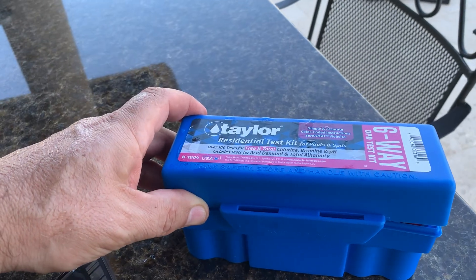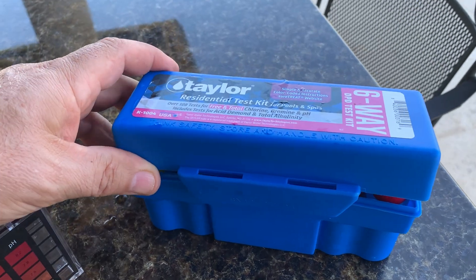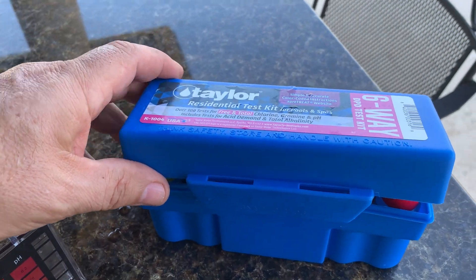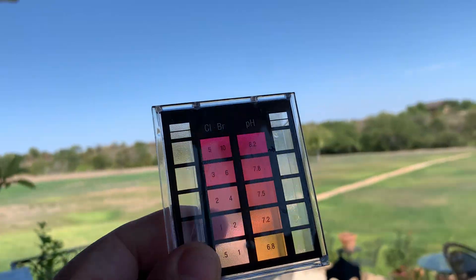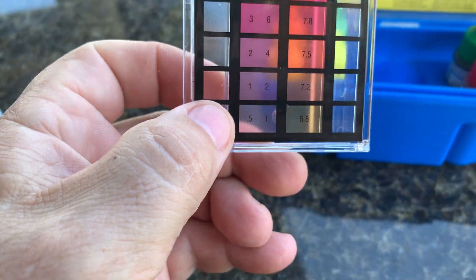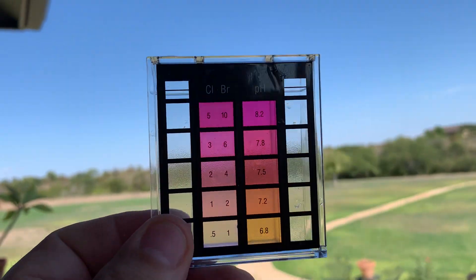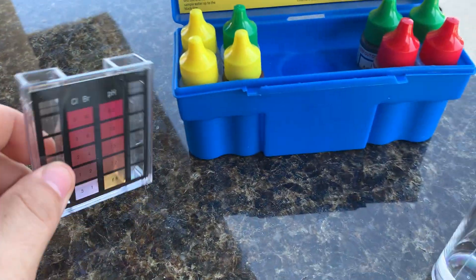Got the six-way Taylor test kit here for quick and dirty chlorine, alkalinity, and pH testing. This has got the DPD chlorine test, and what that translates into is a pink gauge rather than a yellow one. You're going to get a little bit better accuracy because the way the color changes is a little more dramatic, so you'll be able to figure out your chlorine levels a bit closer.